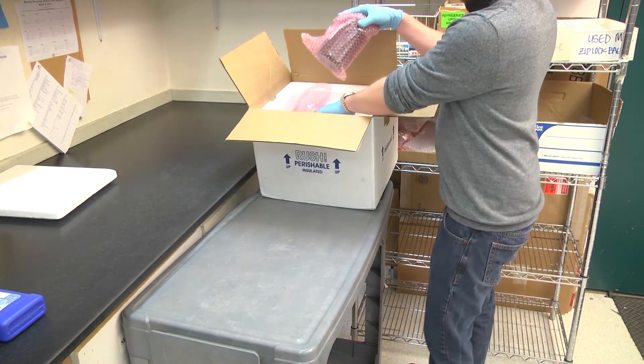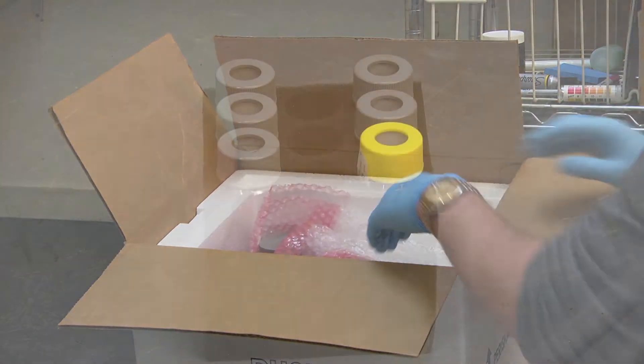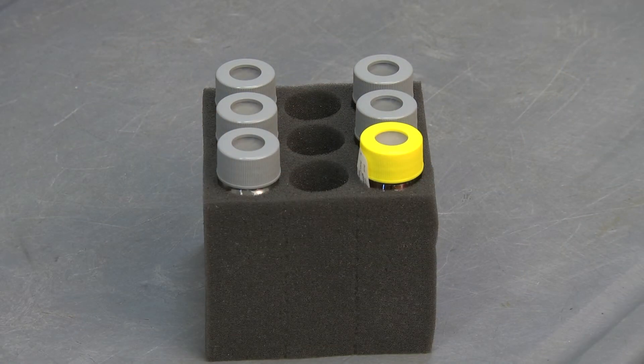Pack the samples in the cooler and add enough fill or cushioning to ensure that the samples will not rattle around or break. Foam inserts are an excellent choice.